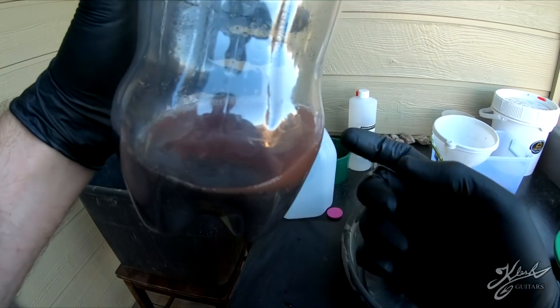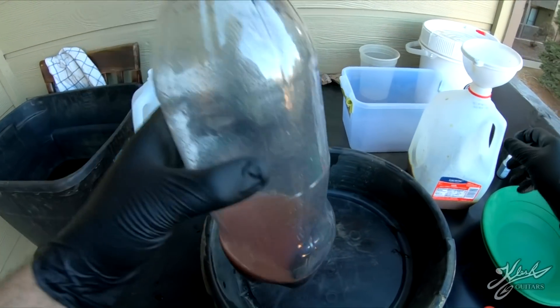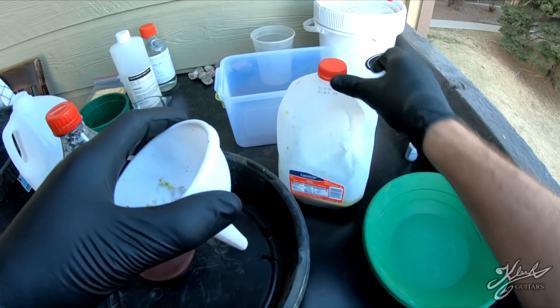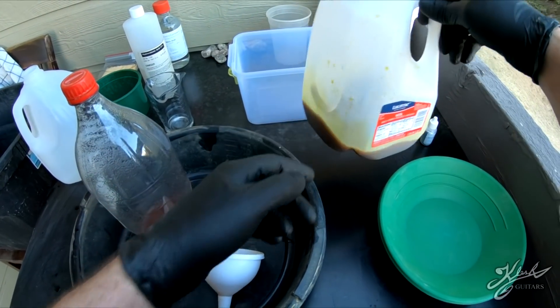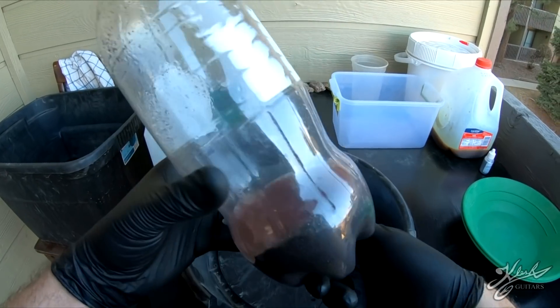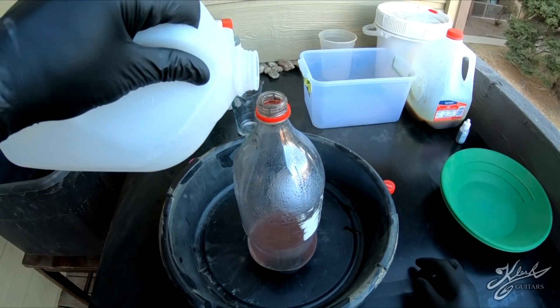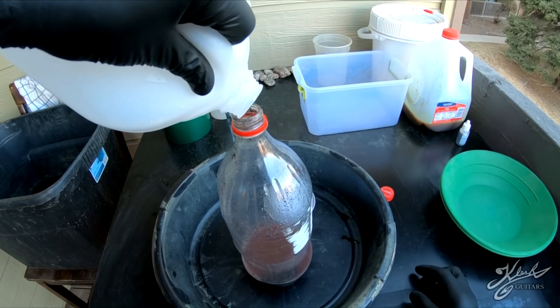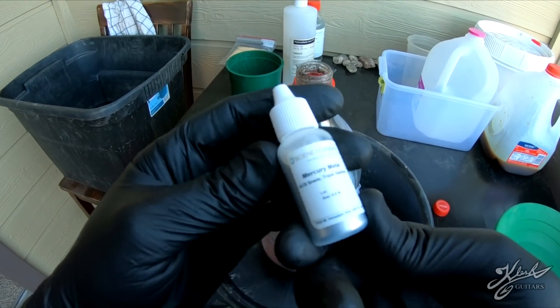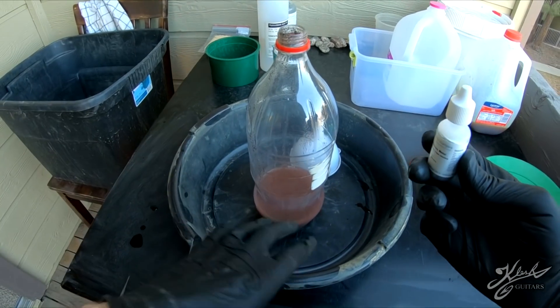We rinsed it out about six or seven times here. The water isn't getting any cleaner but that really doesn't matter - most of the acid is out of there. We need to contain our waste - put a lid on it, set that off to the side, make sure it's marked 'acid, poison.' Now we have our clean black sand and we're going to add a little bit more water.